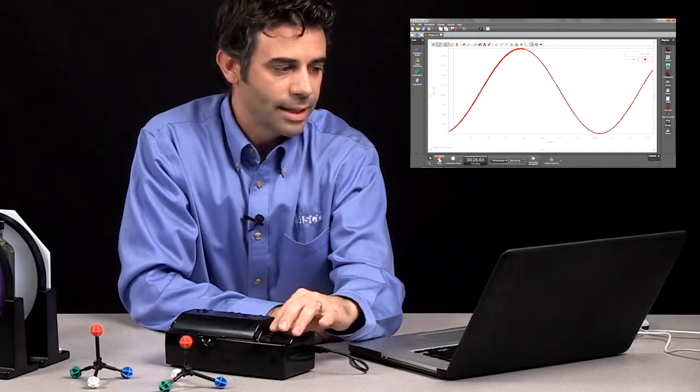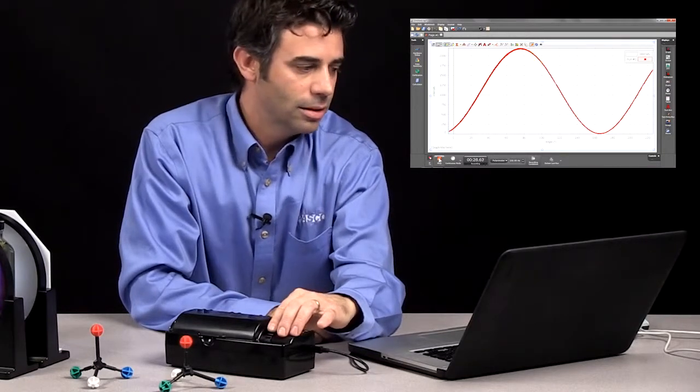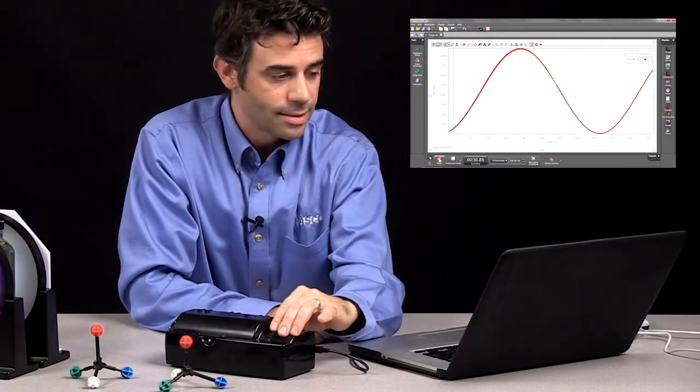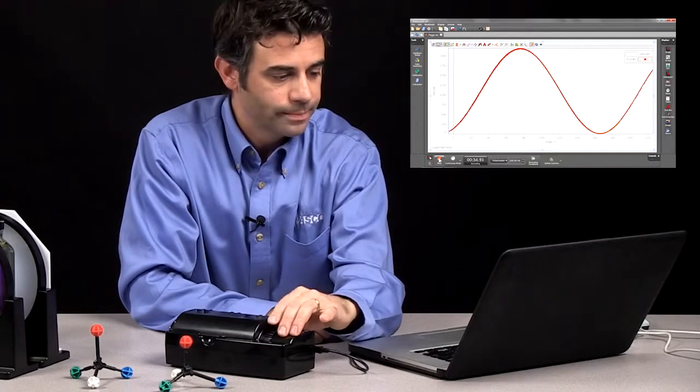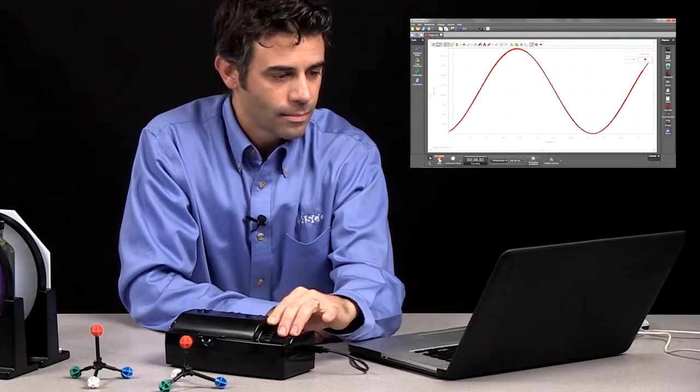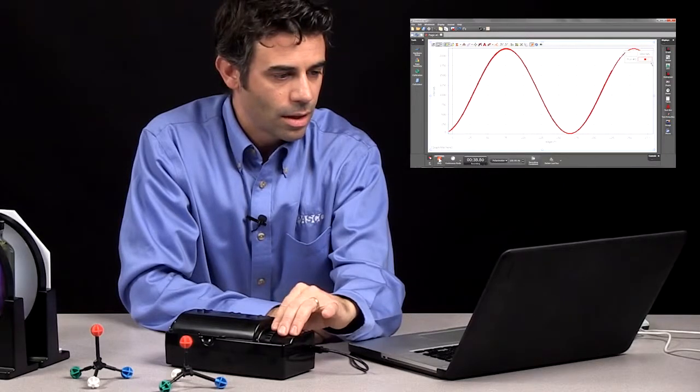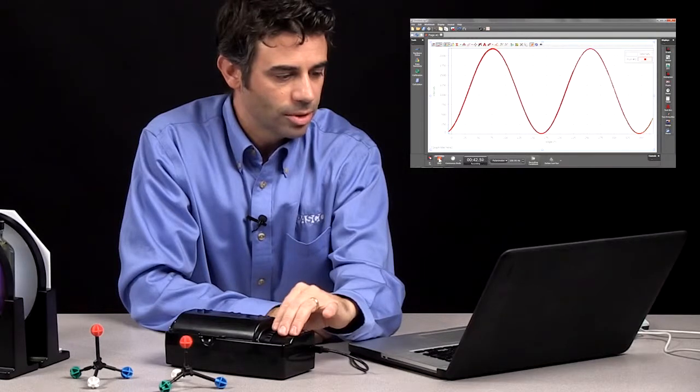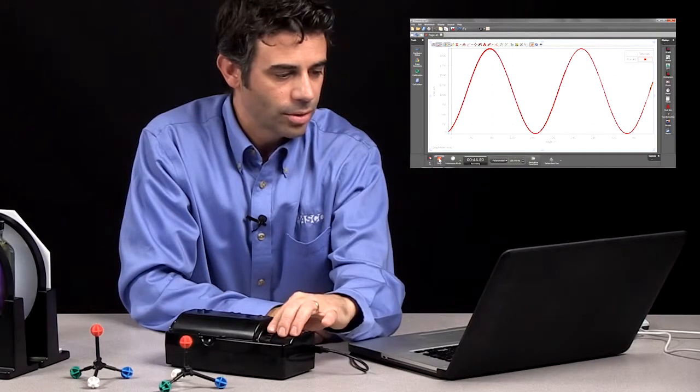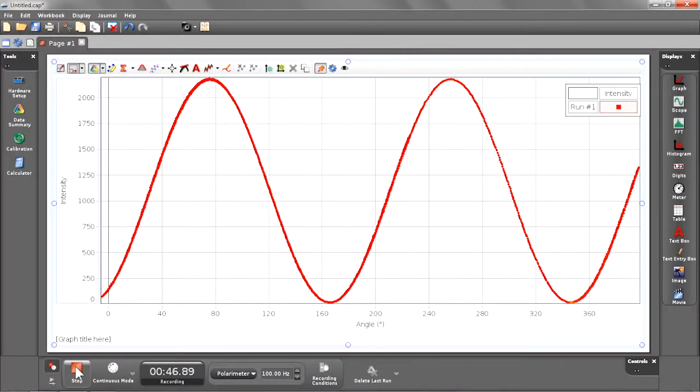To make sure I have lots of good data to get a good fit on so that I can really pinpoint that exact angle at the highest intensity. I'm going to spin it around a little more. And there we go. A couple of cycles through. And we got through our 360. And I'm just going to hit stop now.